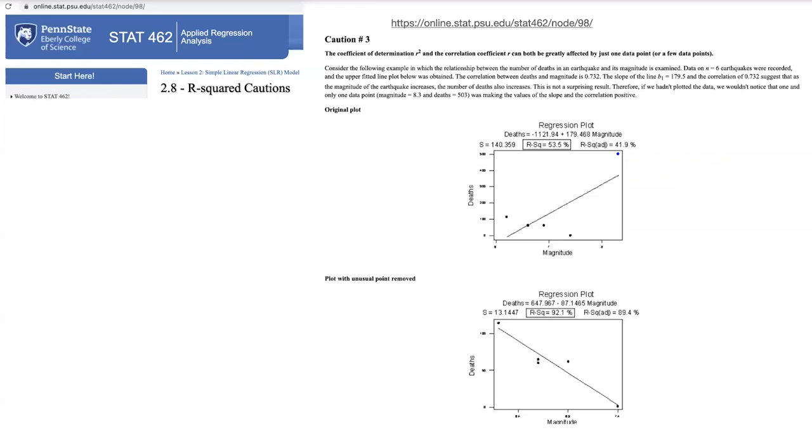And also, when you're doing one of these standard curves, it's helpful if you do it in replicates. So they do say do duplicates, or what's more helpful, although gives you more work, is a triplicate. With a duplicate, if you have two things, you're not sure which one's right. With a triplicate, the one that is closer to two of them is probably more accurate. But anyway, if you have one of those really clear outliers, it can really influence your R squared value. So this influence is taking this R squared from about 90% down to about 40%. Not only that, but it's totally changing the slope of the line, making it look like you have this positive trend and really you have this negative trend.